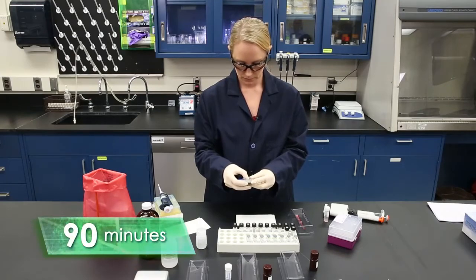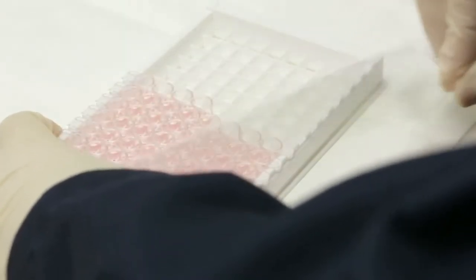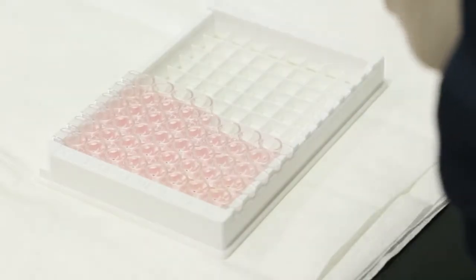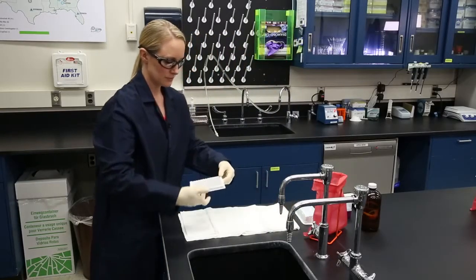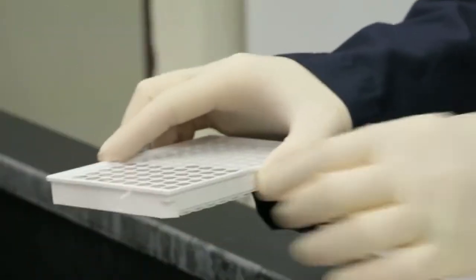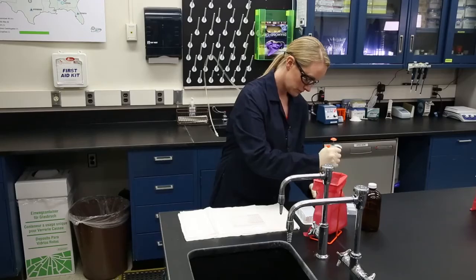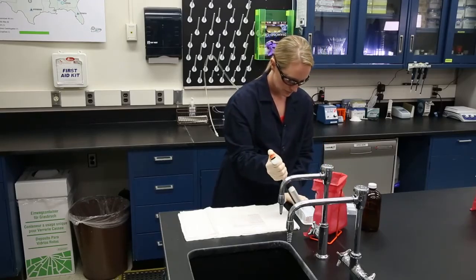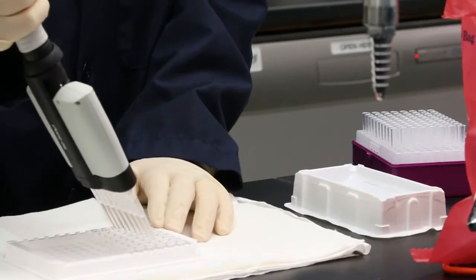Start the timer for 90 minutes. Incubate the samples at room temperature. After the 90-minute incubation, remove the covering, turn the plate upside down over a sink, and vigorously shake the contents out of the wells. Using a multi-channel pipette filled with diluted wash solution, generously rinse each well.